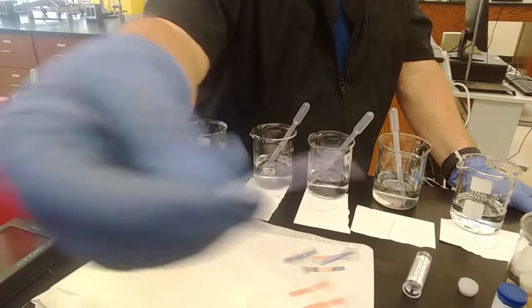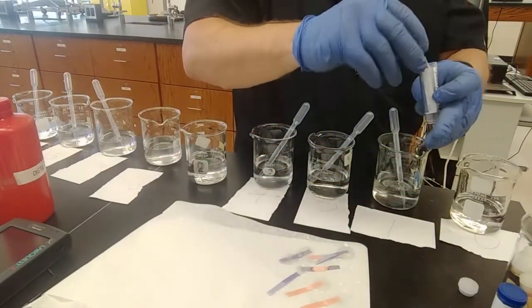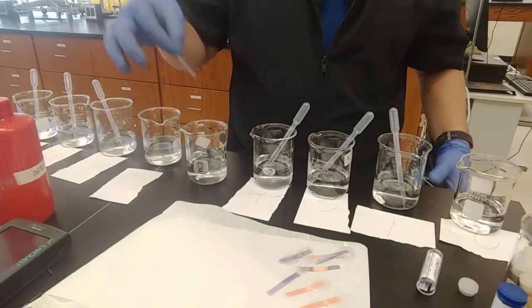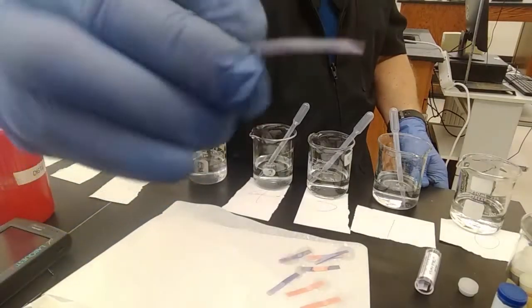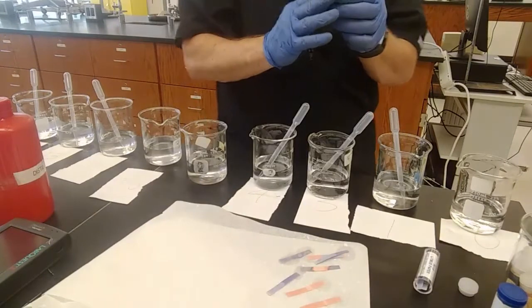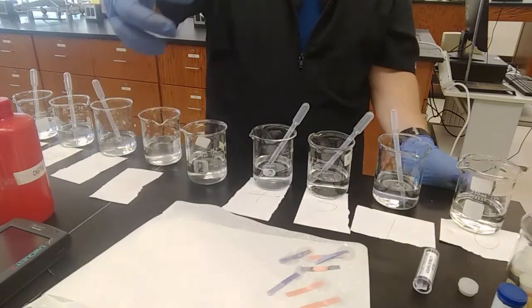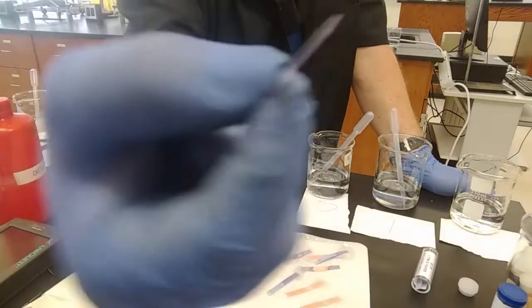It seems like it might have turned red a little bit. Based on our pH meter, it's definitely acidic. With the litmus paper might be old and hard to tell. We tested our neutral, supposedly pH 7 before and didn't get a change with the red litmus paper. We're also not getting much of a change with the blue. 10, interestingly, seems to have changed more than the 7 did.